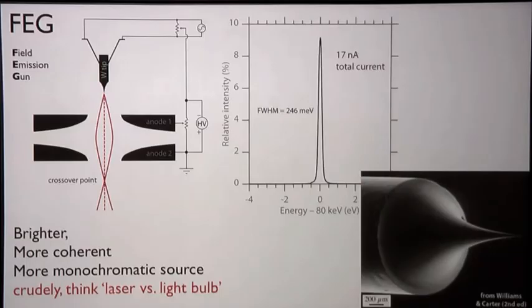So remember, the field emission source, you're basically applying a very high voltage to a tip. And one of the best ways to make a very high voltage is actually to make something sharp. Right? So this is the sharp tip on the end of a field emission source. You can think of it just like a lightning rod. Field strengths are concentrated on the sharpest tips. Right? So just the same way the field strength on the top of a lightning rod will attract a lightning bolt, the same thing happens here.